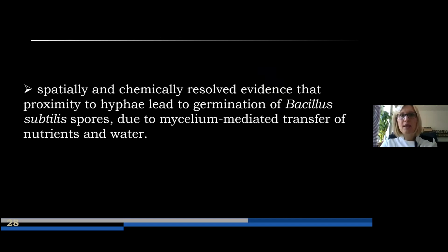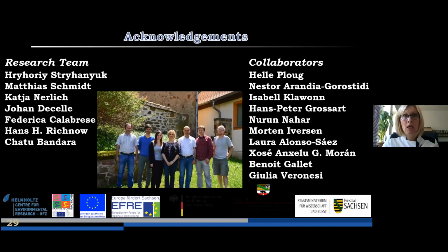So, spatially and chemically resolved evidence we provide by this study that the proximity to hyphae plays a significant role in germination of the spores. And therefore it highlights the importance of the mycelium-mediated transfer of nutrients and water also in systems like soil, for example, where they are in high numbers. So I hope that I convinced you that these techniques are very important in the field of microbial ecology and environmental microbiology.